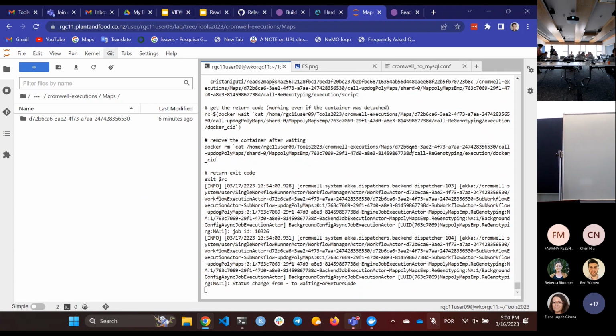this doesn't have a last one because it's branches, so you have steps for all of them. So you can upload them to save everything and then look at it. There are lots of things that we can do. These are the questions that we ask. That's what I'm doing research on now. And this one didn't finish, yours broke in the middle.